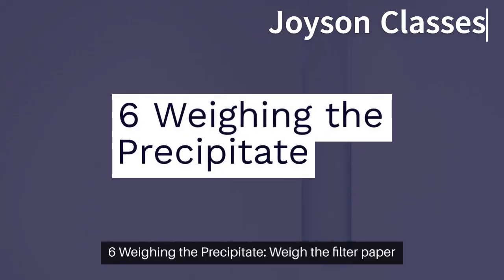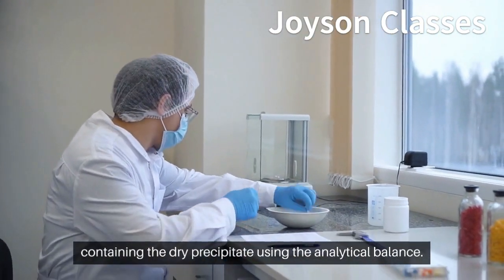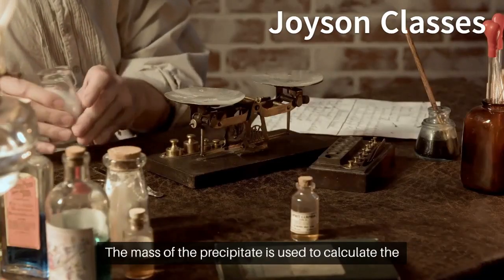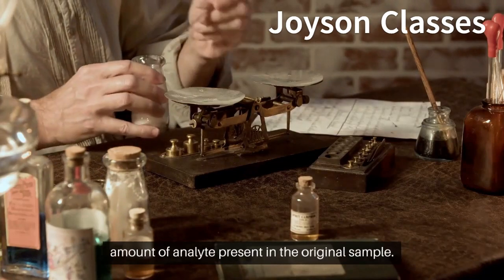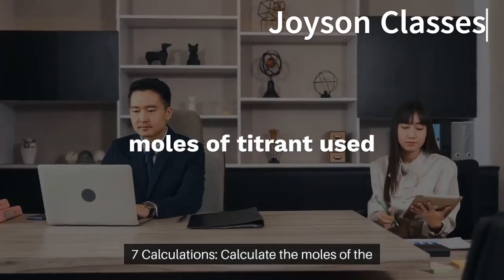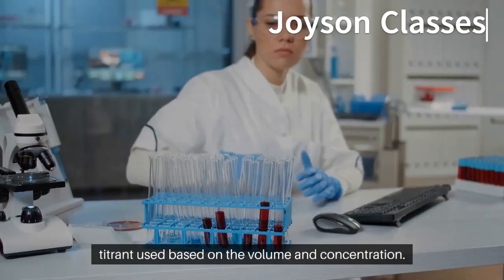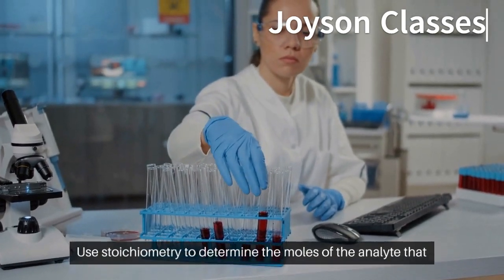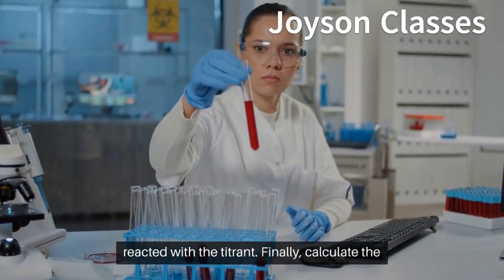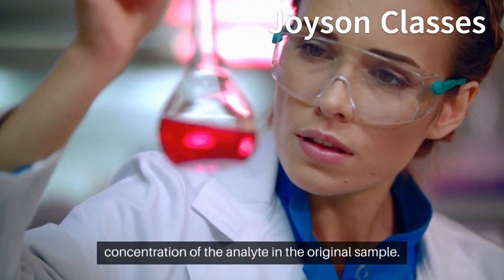6. Weighing the precipitate. Weigh the filter paper containing the dry precipitate using the analytical balance. The mass of the precipitate is used to calculate the amount of analyte present in the original sample. 7. Calculations. Calculate the moles of the titrant used based on the volume and concentration. Use stoichiometry to determine the moles of the analyte that reacted with the titrant. Finally, calculate the concentration of the analyte in the original sample.